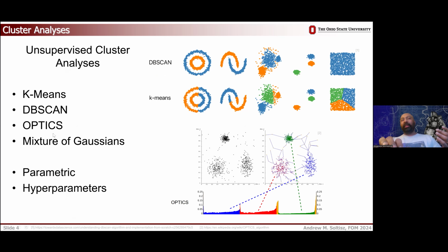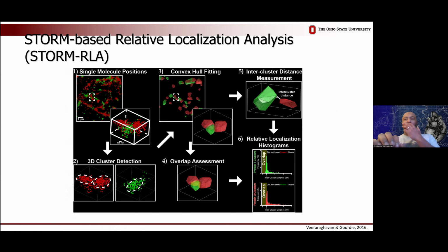Typically, one of the things we want is we don't want to have to know a whole lot about the system before we start analysis. So something like k-means is less useful because you need to know a priori the number of clusters you're looking for, and we won't know that with any kind of microscope image. So methods like DBSCAN, which is a density-based clustering algorithm, become extremely useful. This is work I did as a postdoc where we built a density-based clustering approach which finds clusters of these single molecule localizations from STORM data.